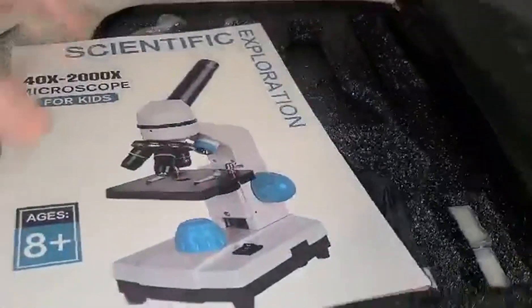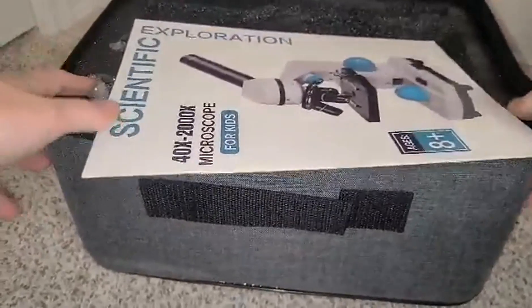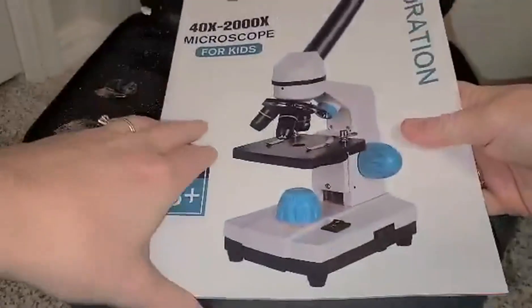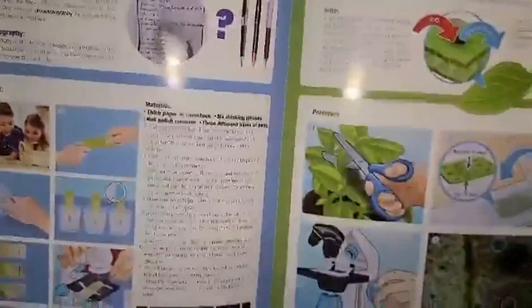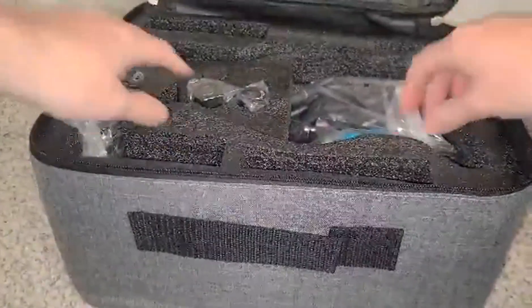So I've got this awesome microscope here and it comes with this really great storage case which is very convenient. Then you've got your instructions here and also some different little experiments and projects that you can do — some ideas that are very detailed, so that is cool.